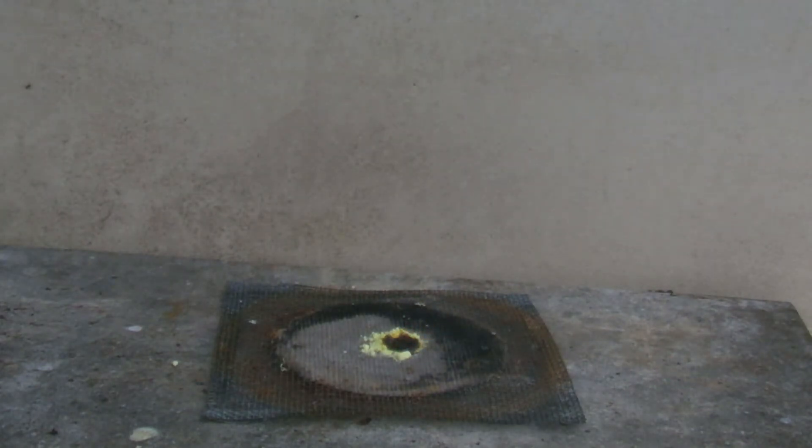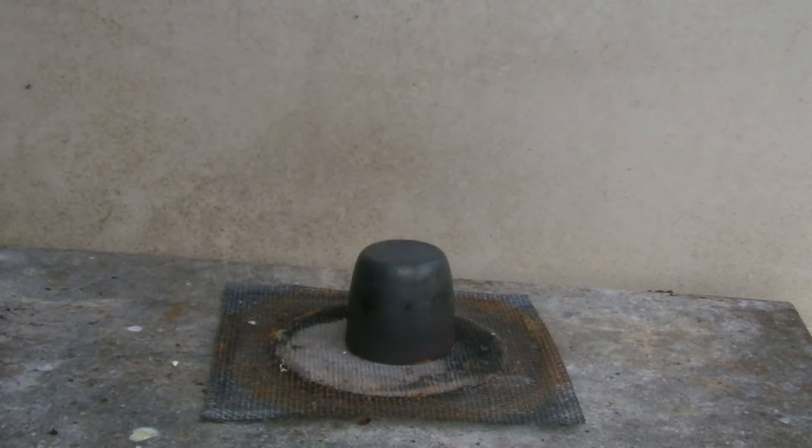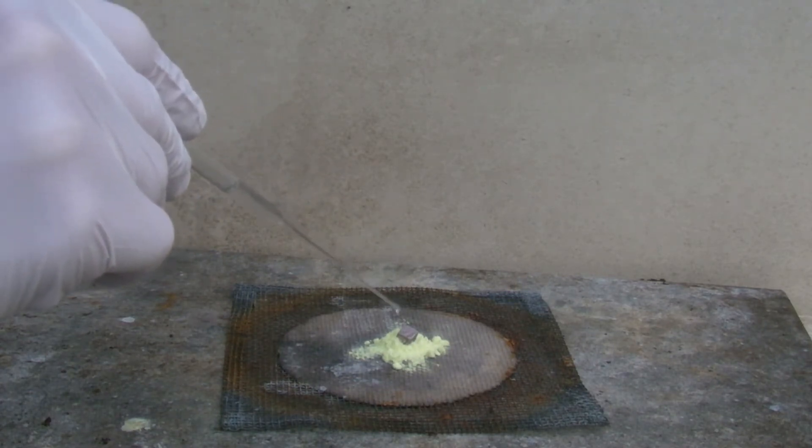To extinguish the sulfur and prevent the formation of large amounts of sulfur dioxide, the residue is covered. Sometimes several drops of water are needed when the piece of sodium is larger.